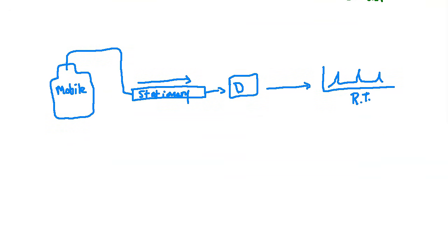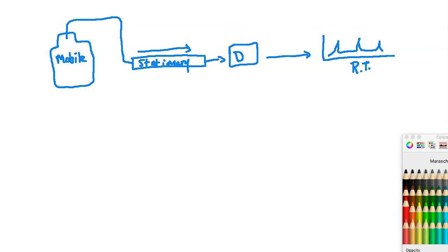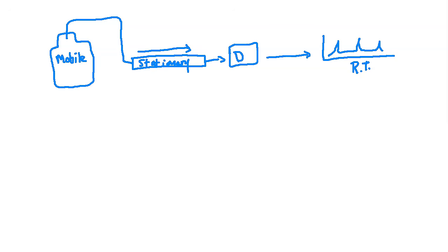All right. So one of the things I mentioned here was there are different types of material that get packed in your columns, and as the chemist, you have to decide what type of column you want to pick out in order to get the best separation. And each of those can go into their own lecture. So we can talk about, and we will make a list, but we can talk about things such as ion exchange or reverse phase or normal phase HPLC. Those all have different meanings. They have different type of mobile phase and stationary phase setups.